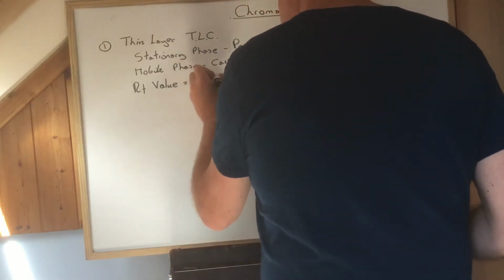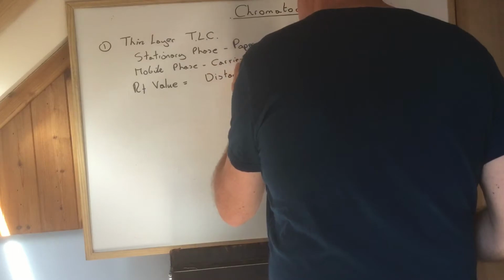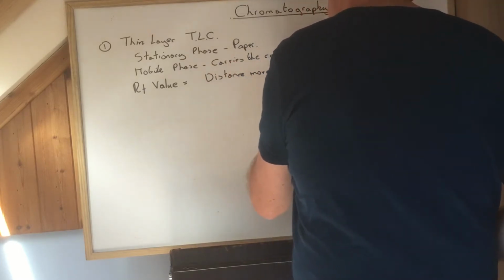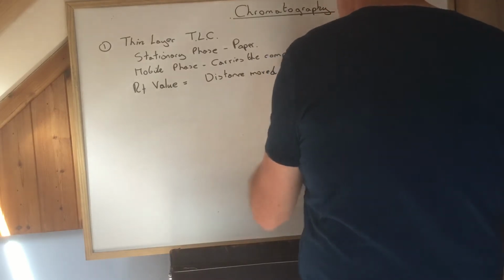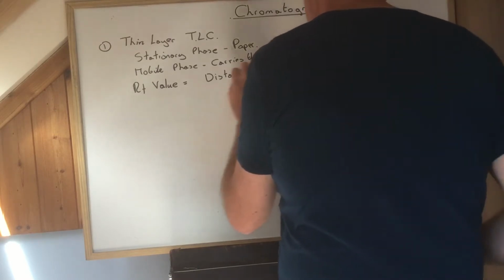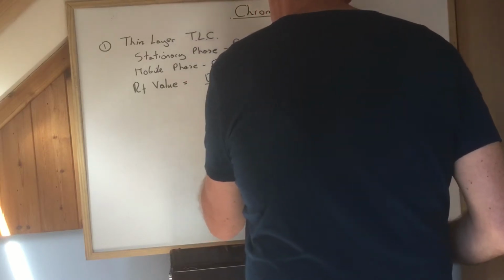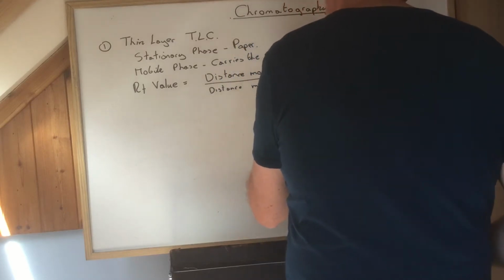It's basically the distance moved by the component, divided by the distance moved by the solvent front.